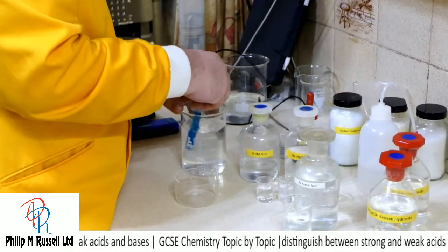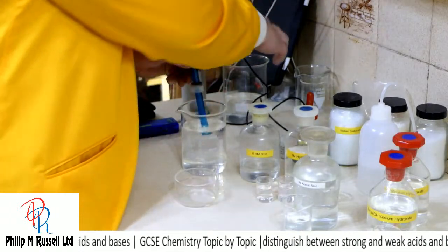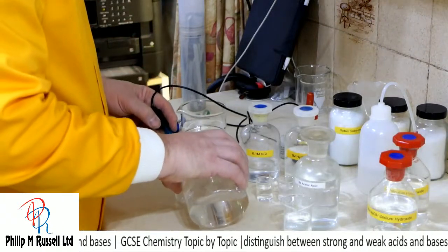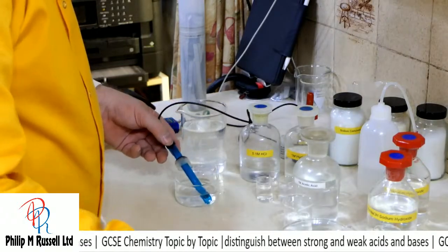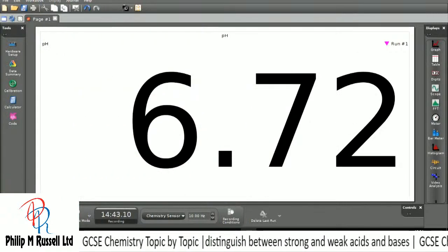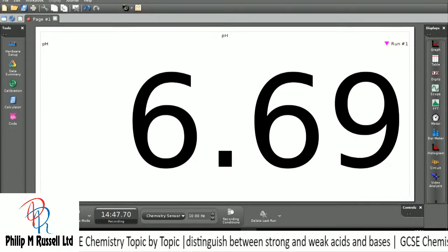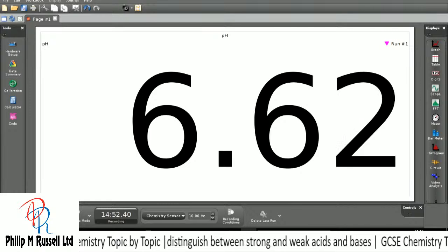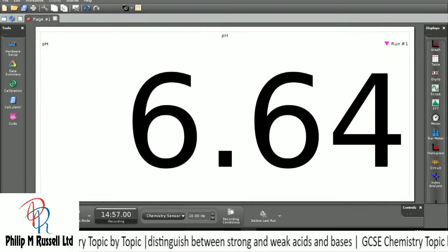Just got a fair bit of dirty water here that I'm washing this in first, and then I can wash this in a little bit of cleaner water, and we should get this pH probe going back to about 7 before I put it back in the potassium chloride solution. 6.6.